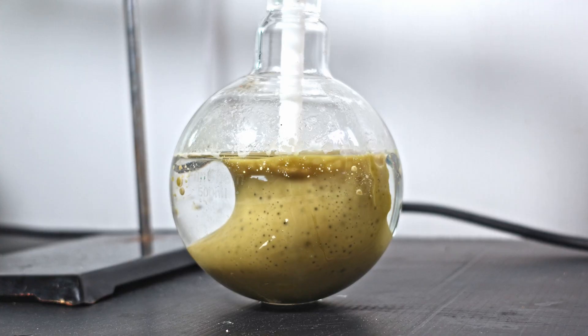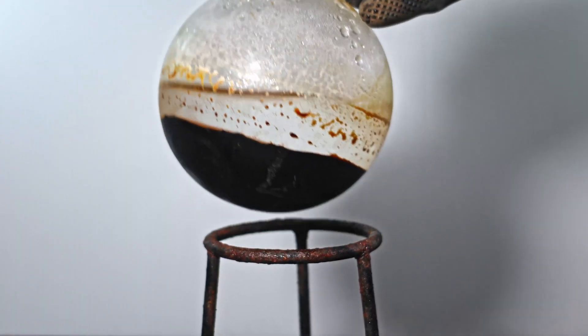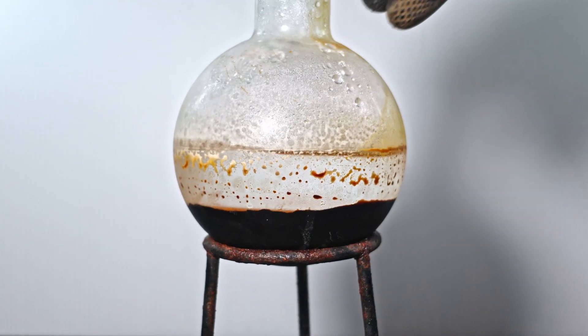Welcome back to another fan favorite episode. In this one I make chlorinated vegetable oil. I want to see if this is simply an analog of brominated vegetable oil or has its own set of unique properties.